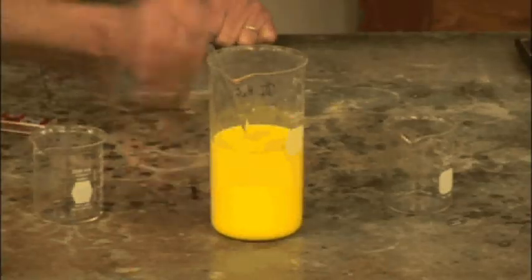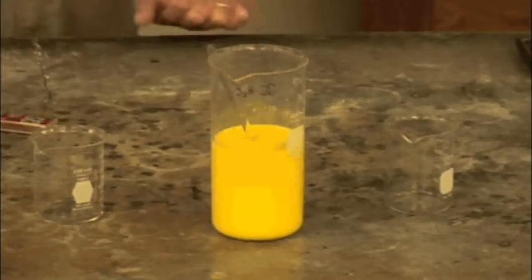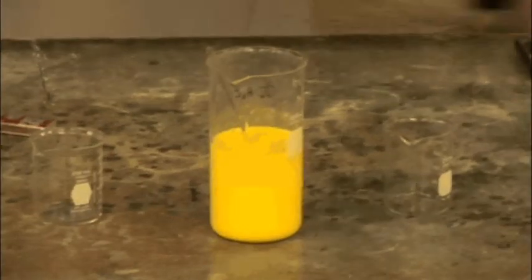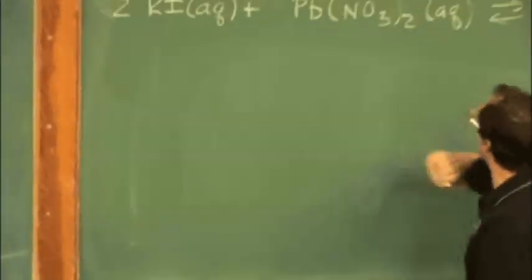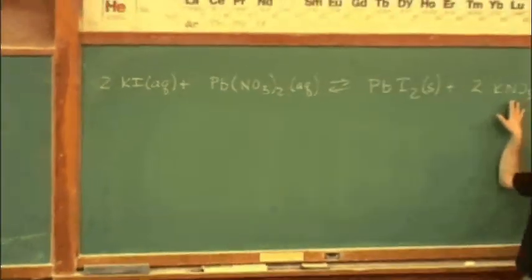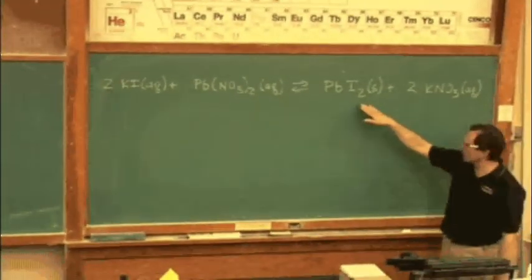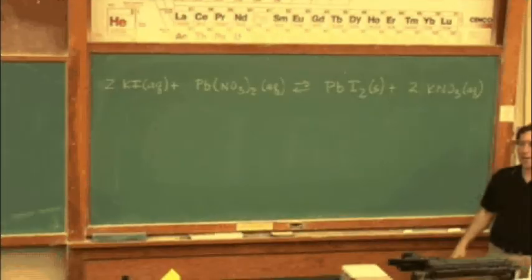Eventually we'll have the yellow powder down at the bottom and the aqueous solution up on top. In the aqueous solution we're going to have lead nitrate, potassium iodide, and potassium nitrate. So we're going to have our dissolved ions. And down at the bottom of the beaker shortly as it crashes down is going to be the lead iodide.